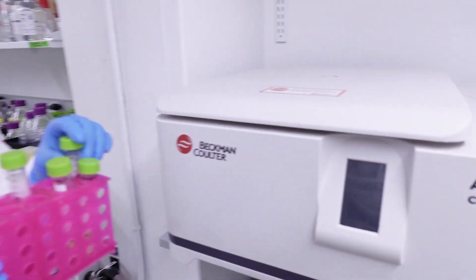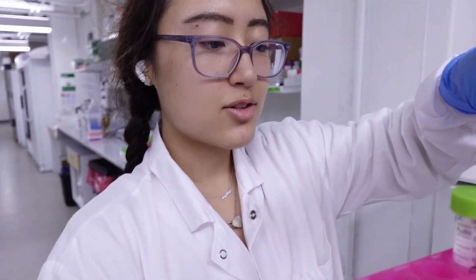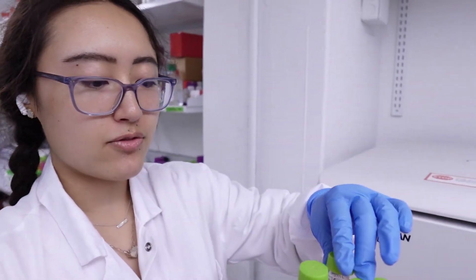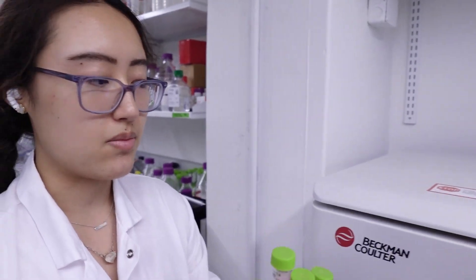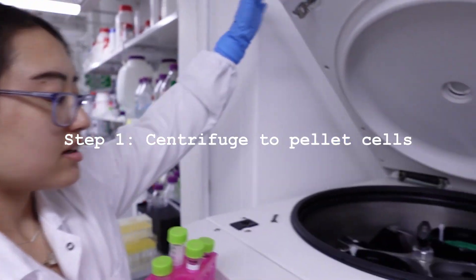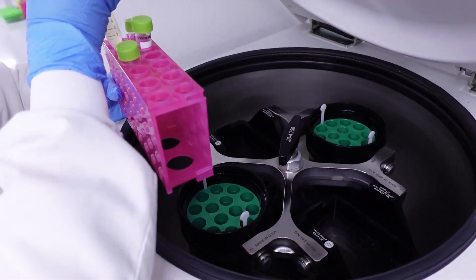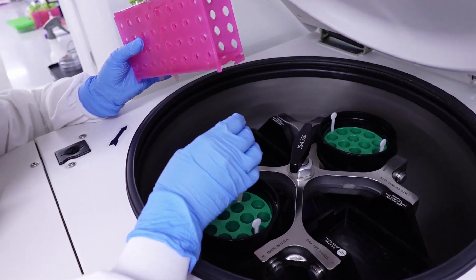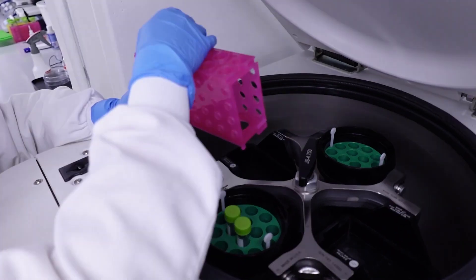Essentially, the way centrifuging works is it spins the tubes around very, very quickly and forces all the solids to sediment at the bottom in a compact pellet while all the liquid stays above. And then we can just aspirate or take out the liquid and leave the cell pelleted at the bottom. So centrifuges — you always have to be very careful about making sure that they're balanced because they rotate at such a high speed that any slight lack of balance can really mess them up.